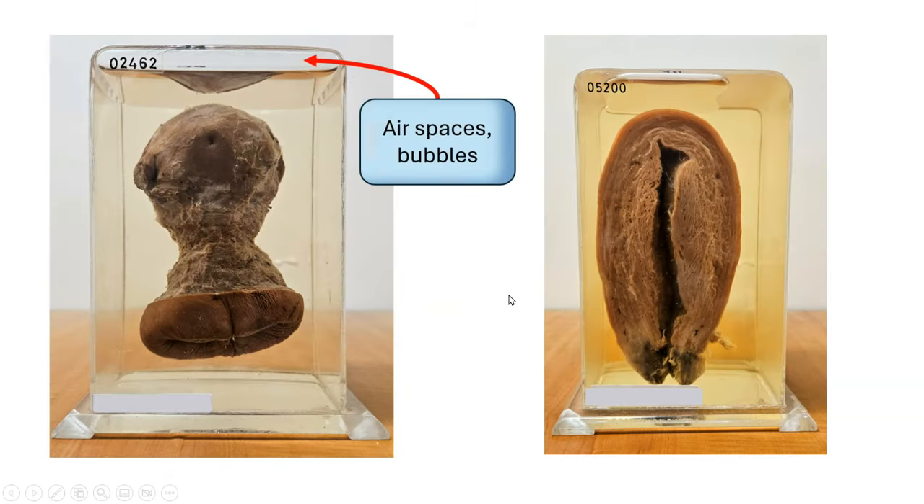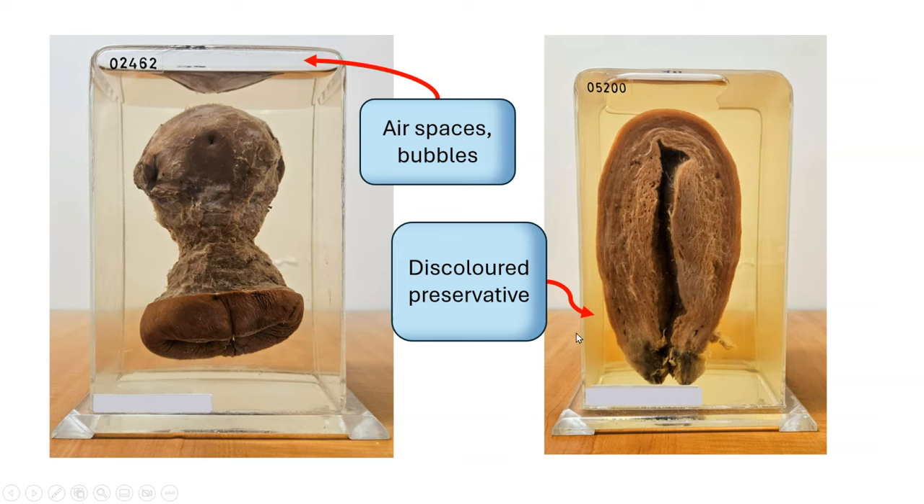Over time, there may be air spaces or bubbles accumulating within the specimen pot, or the preservative can become discolored, or sometimes the specimen can shed small bits of tissue into the fluid.